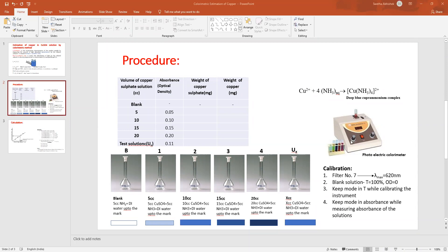Once the instrument is calibrated, switch the mode to absorbance. Place solutions 1 through 4 and the unknown one by one in the colorimeter and measure the corresponding absorbance. For blank there is no absorbance. Approximately: for 5 cc it is 0.05, for 10 cc it is 0.10, for 15 cc it is 0.15, for 20 cc it is 0.20, and for the unknown it may be around 0.11 for example.